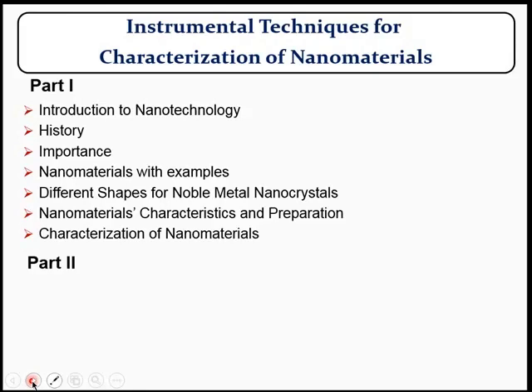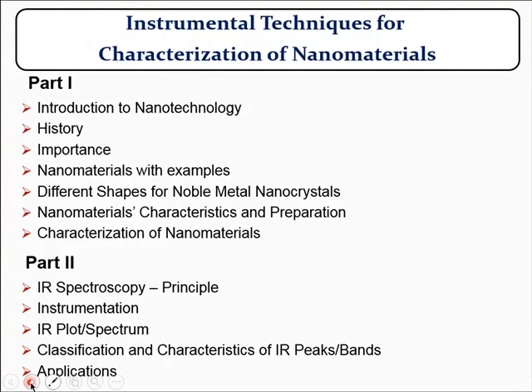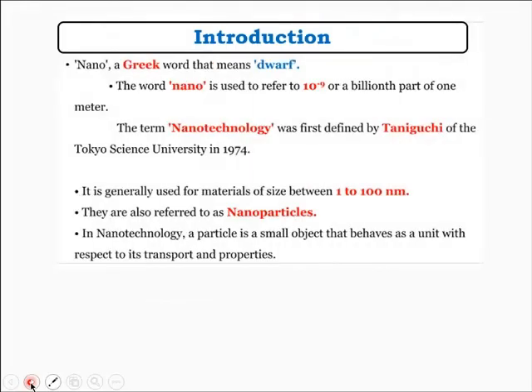In the second part, we will discuss in detail the IR spectroscopy, like principle, IR instrumentation, how an IR spectrum plot actually looks like, peaks classification, and then characteristics, and in the end we will see the various applications of IR spectroscopy. So let's start with the introduction.